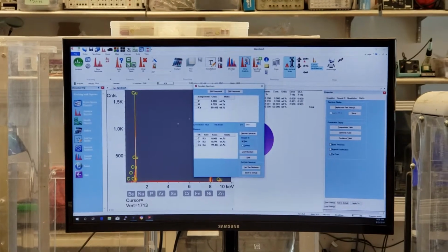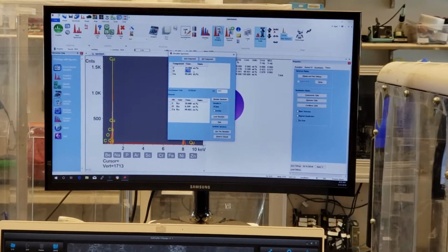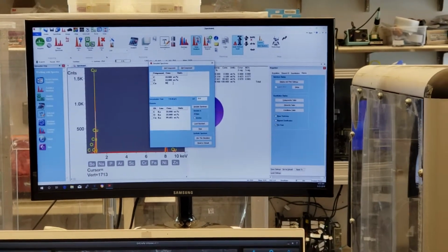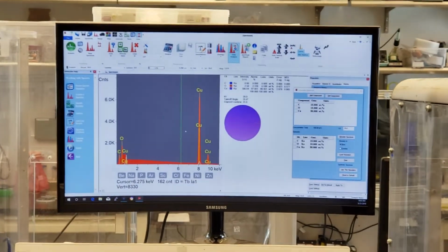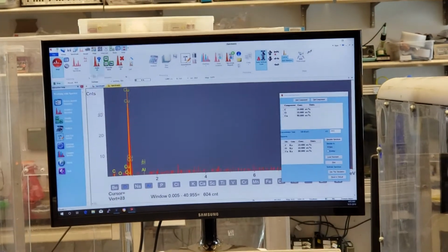Spectra synthesis right there, we could say, let's say if this spectra was 10% carbon, 10% oxygen, and 80% copper, well, simulate it. Tell me what that looks like. So it just simulated that spectra over here, and that's what it would have looked like. And so for instance, if I acquired another spectra, let me just kind of show you this really quick.